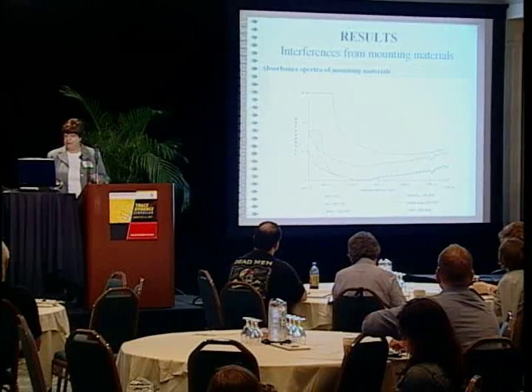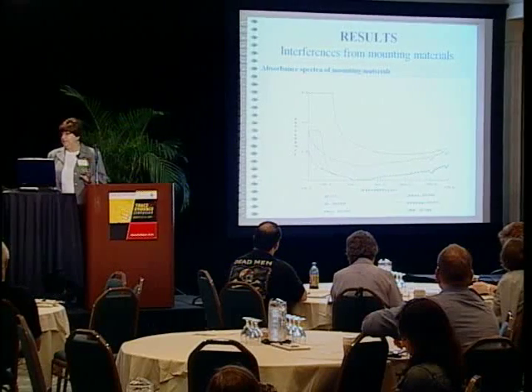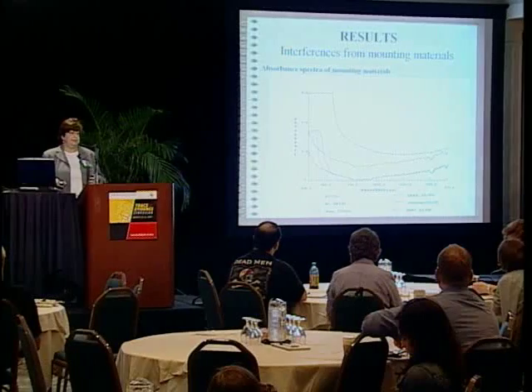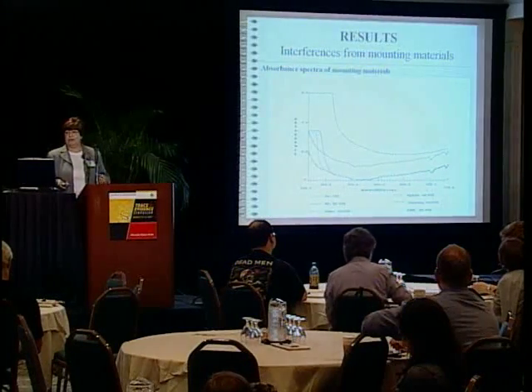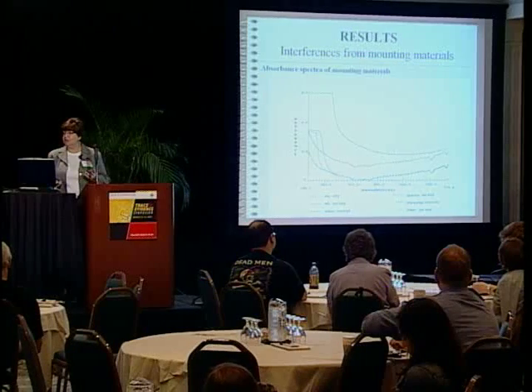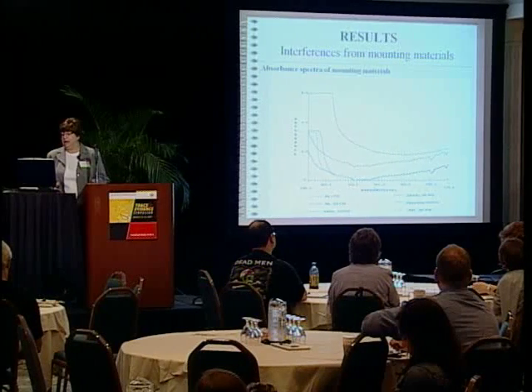However, with the glass, there's substantial absorption that occurred at 310 nanometers, and there was complete cutoff at 280 nanometers. For ZAM, there was substantial absorption that occurred at 290 nanometers, and there's complete cutoff at 265 nanometers.